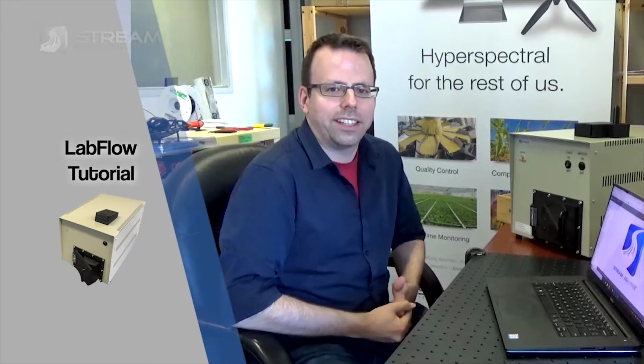My name is Trevor Allen and I'm an optical scientist here at Stream Technologies. Today we're going to be showing you how to set up and use your new LabFlow measurement system.